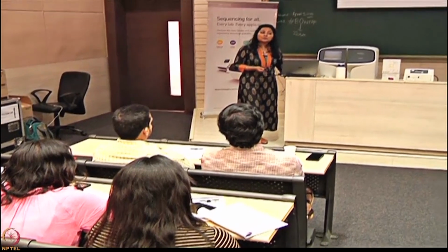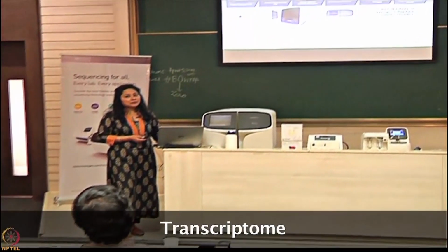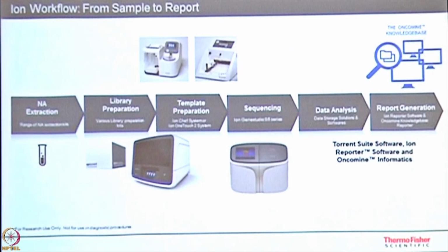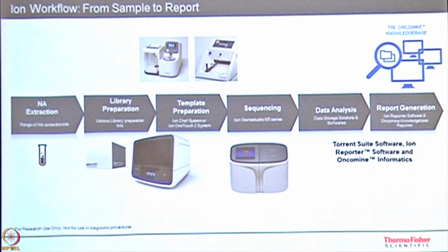So where do you think you would be using RNA as your starting material? Transcriptomes, yeah. Again, you are looking at some targeted transcripts, or you are looking at some targeted fusion events. Anything else? Yeah, RNA-seq. And RNA-seq, typically why would you do an RNA-seq?